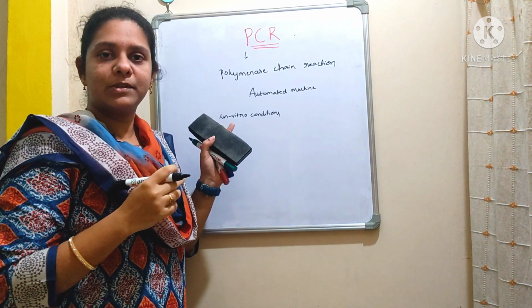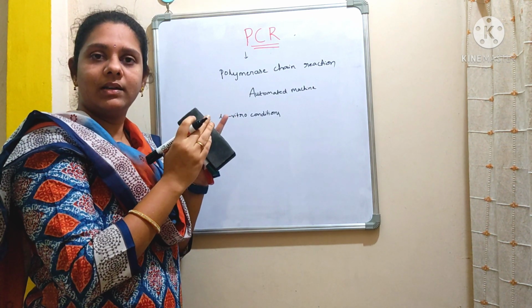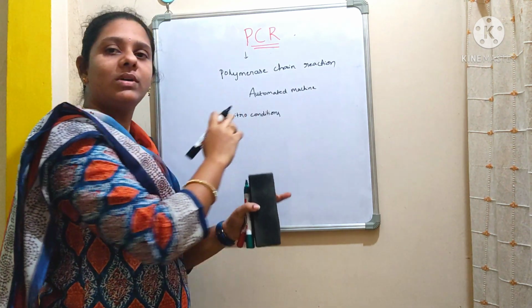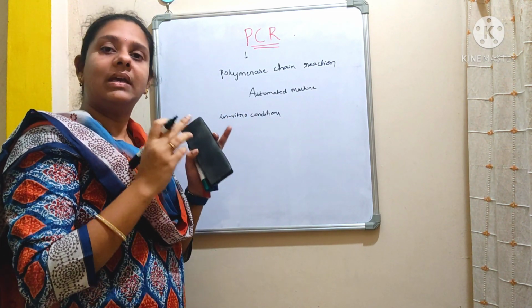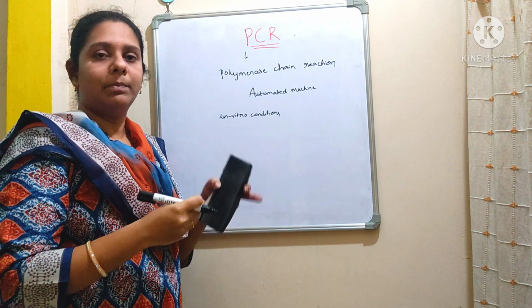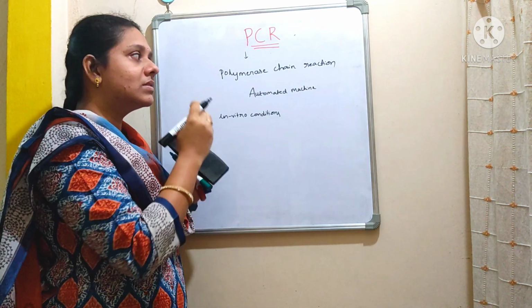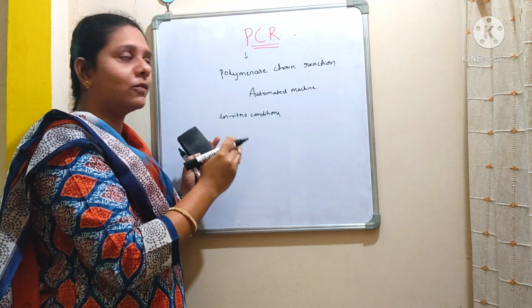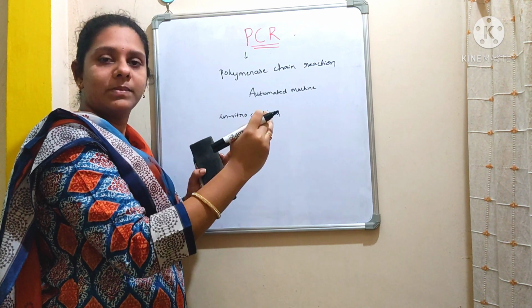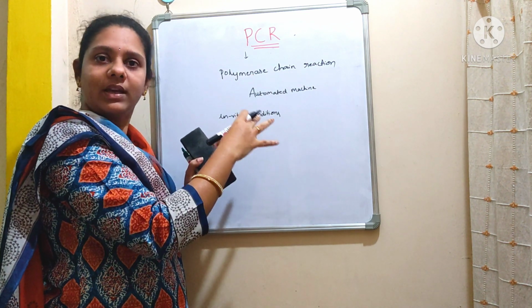You all know the difference between in vitro and in vivo, right? Here we are saying that the synthesis of DNA takes place in vitro conditions. In vivo means within the living organism, but in vitro means within the test tube. So in this instrument we are going to set different temperatures, meaning different steps are going to take place that finally result in the synthesis of DNA.